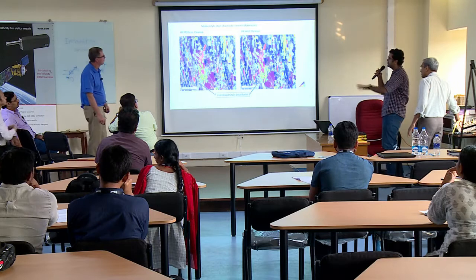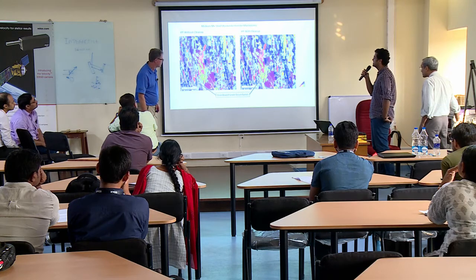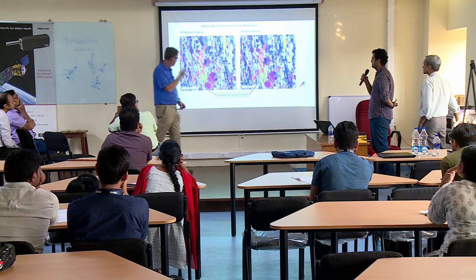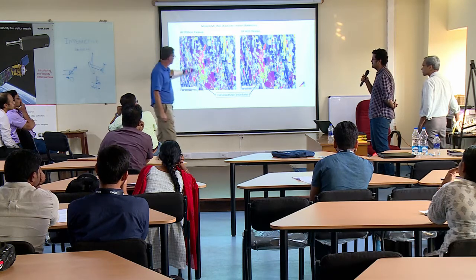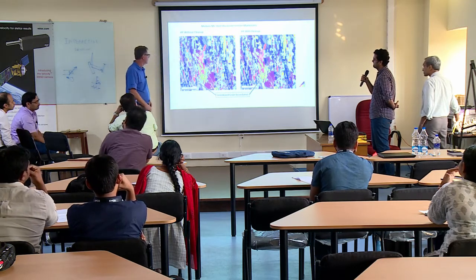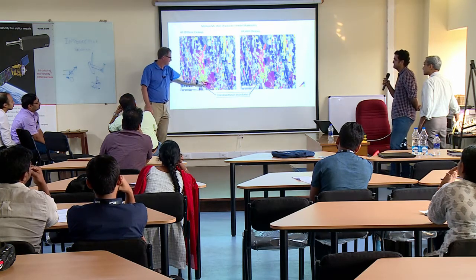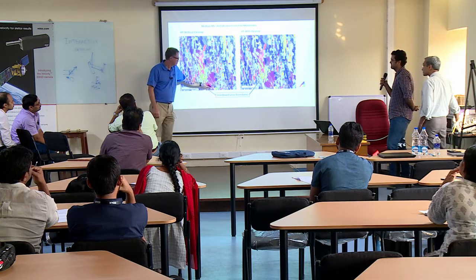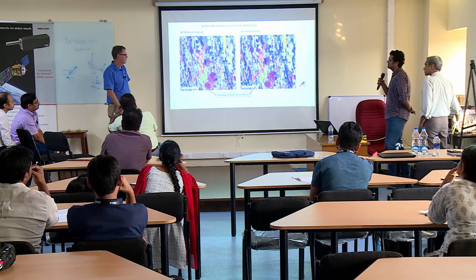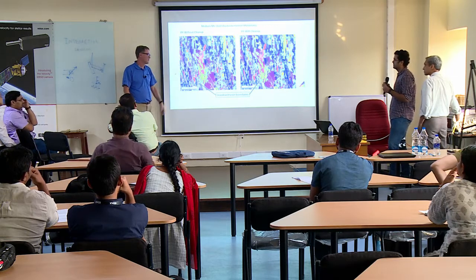Okay, and the problem of grain boundary is not getting indexed. So this is a steel sample that. So, I mean, this one is just, there's lots of noise everywhere. Oh, this is before cleanup and after cleanup. Okay. So whenever I see speckling like that, especially if it's at grain boundaries, I don't get too upset. I don't like this. That really makes me concerned that maybe I have a second phase. Maybe I just have, you know, a precipitate, some dust on my sample or something.